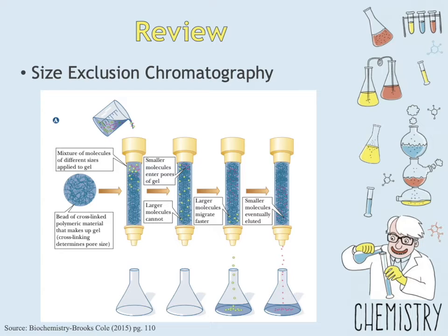We have fully understood and know that the first type of chromatography is a technique that is being used to separate the dissolved macromolecules by size based on their elution from columns filled with a porous gel. As you can see on your screens, the beaker here contains a mixture of molecules that is being poured in the column. And on your left side, there is a representation of how the porous gel looks.